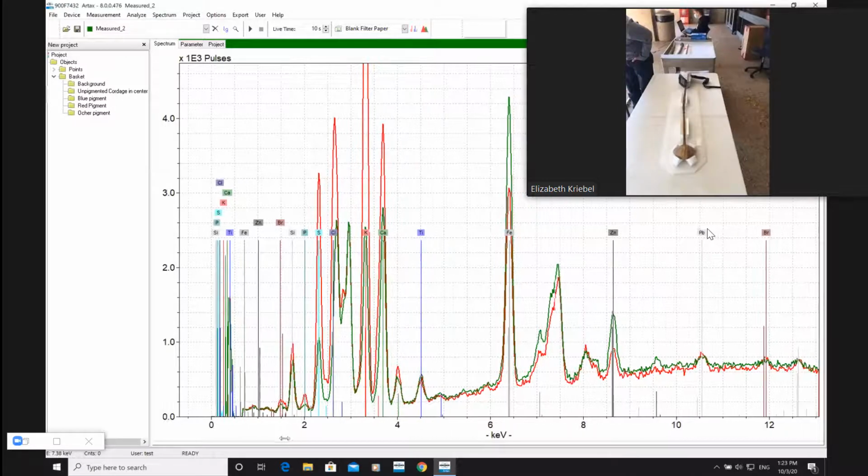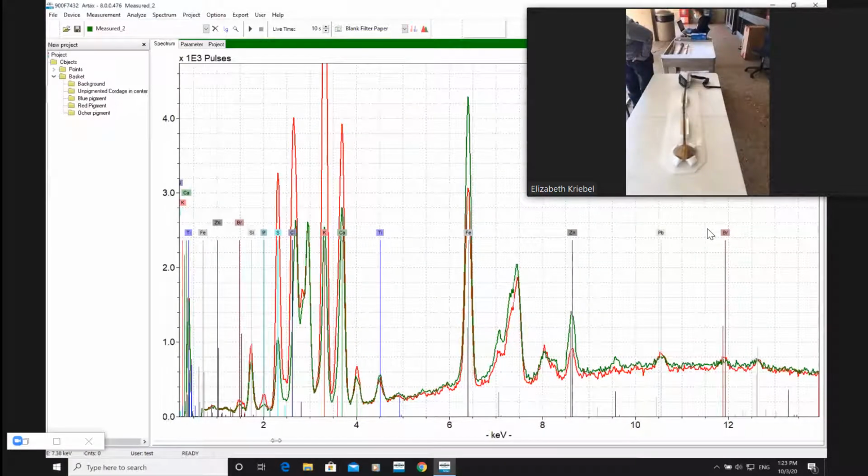They also have more salt too. Yeah, it's evidenced in the more increased bromine and chlorine, so it's more of the same. And that was on the grip? Yeah, that's on the grip too. So all salt washed. Any other part of this one that stands out that we should take a look at?